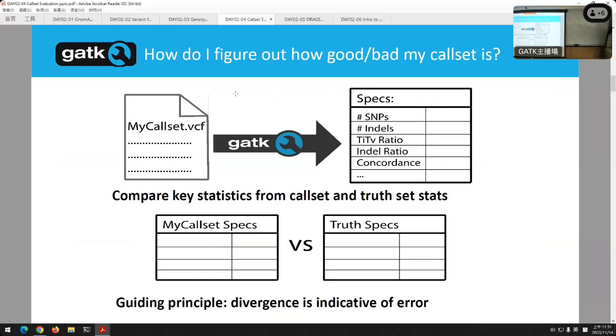So what we're going to go over a bit is how to find the correct truth set to compare to, because it's really important. Like I said, we have no source of truth in advance when you sequence someone. That's the purpose of sequencing, is to try to find that. So to compare, you have to find something that's going to provide a good equal comparison.